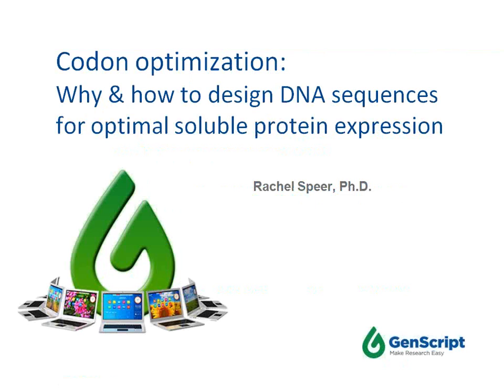So as you might imagine, we ran into our fair share of concerns about getting the right DNA constructs and getting sufficient protein expression. And I'm a bit embarrassed to admit that at the time I was completely unfamiliar with codon optimization and gene synthesis, which may have expedited our experiments considerably. So I'm really excited that you all are attending this webinar today to learn more about codon optimization and how it can help your research.